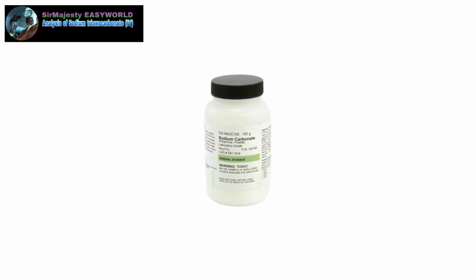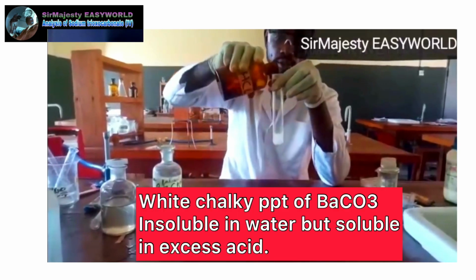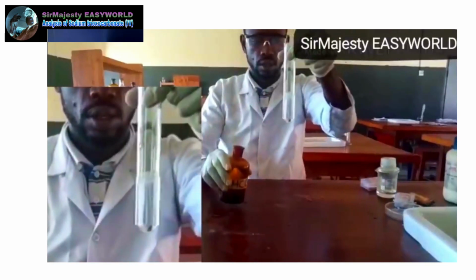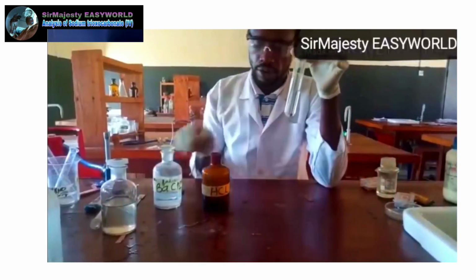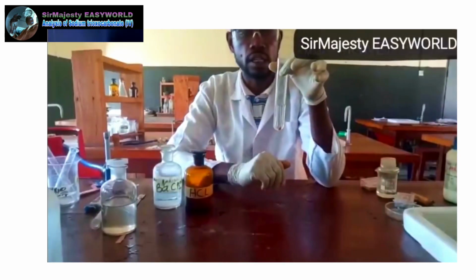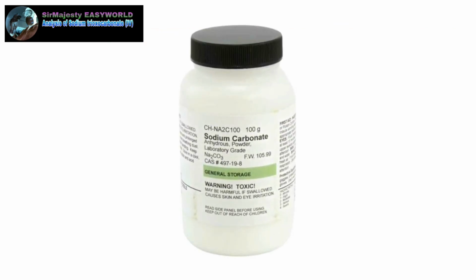So use of barium chloride will first of all precipitate the trioxocarbonate 4 ion in the form of barium trioxocarbonate 4, which will dissolve in excess acid with effervescence. As you can see there, the effervescence occurs liberating colorless, odorless gas which turns lime water milky. So these are the basic guide you actually require to know about sodium trioxocarbonate 4 being a carbonate and containing sodium ion. These are the possible things.